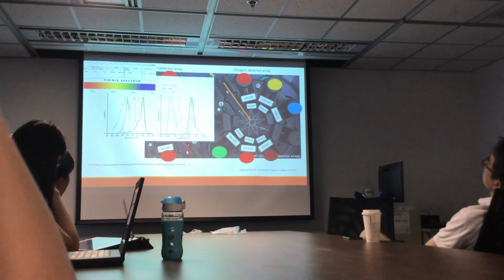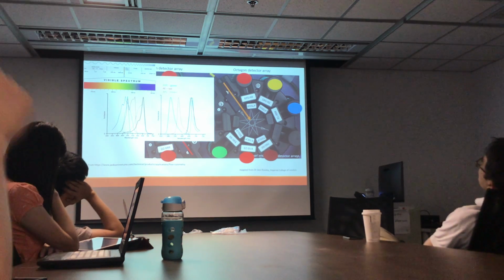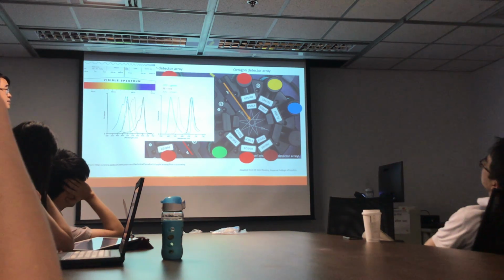So let's take an example of this green fluorescence here, which is around 530 nanometers. When the signal comes in through here, it reaches the first 735 long-pass filter, and as I explained, it will not go through the filter.